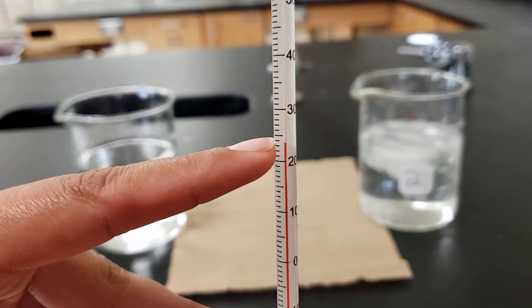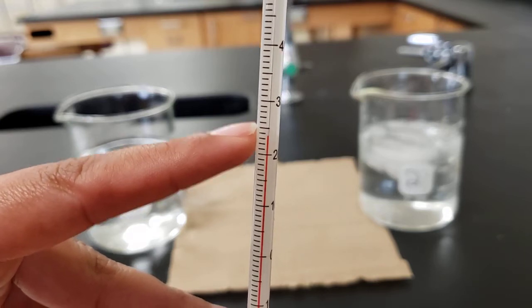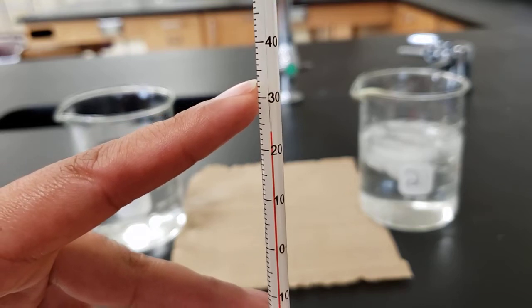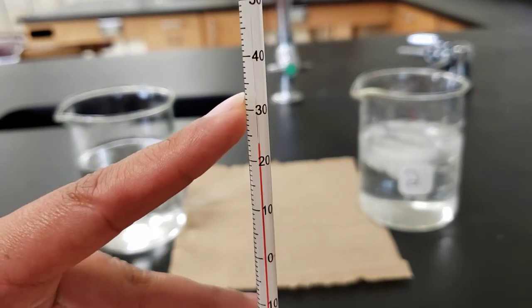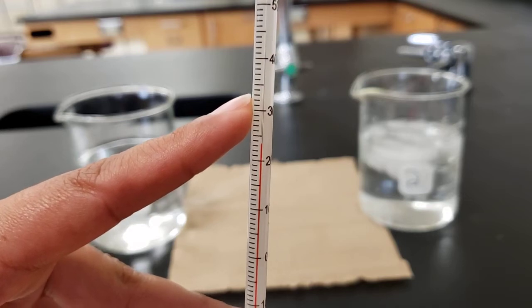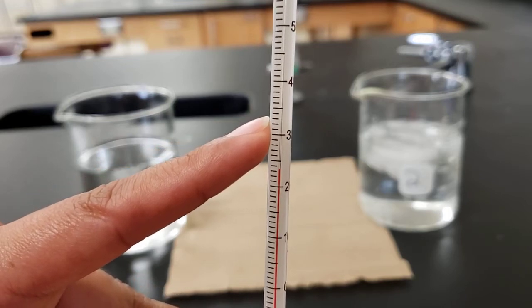And if we look at how many lines are between 20 and 30, again, we count, there's 1, 2, 3, 4, 5, and an additional 1, 2, 3, 4, 5 more. So it means that each line represents 1 degree. And note this is in Celsius, a unit that we use in science class. So right now, this thermometer is at a temperature of roughly 24 Celsius.